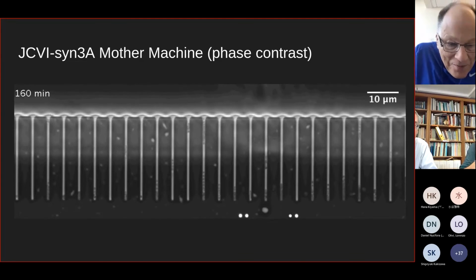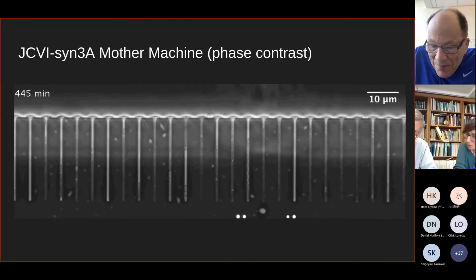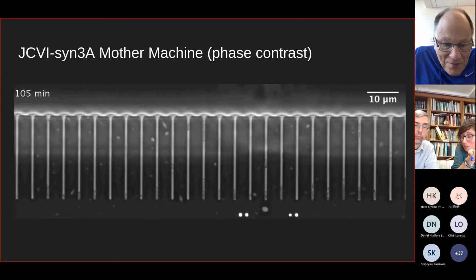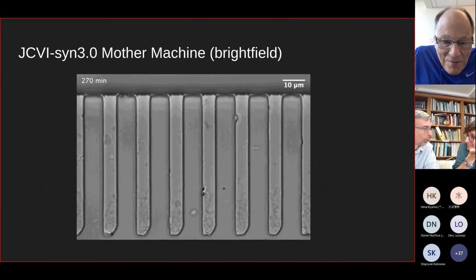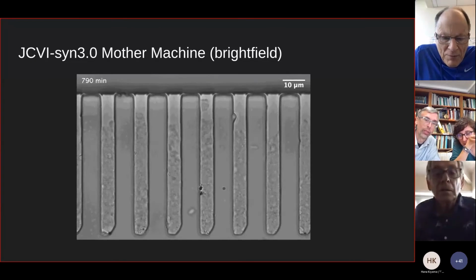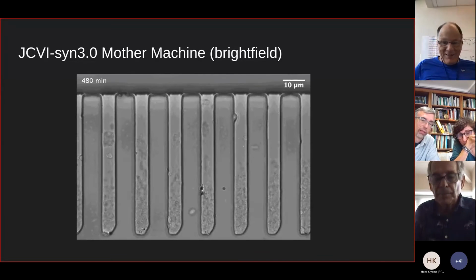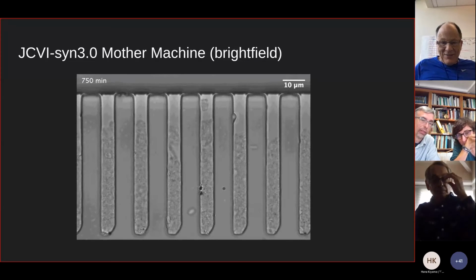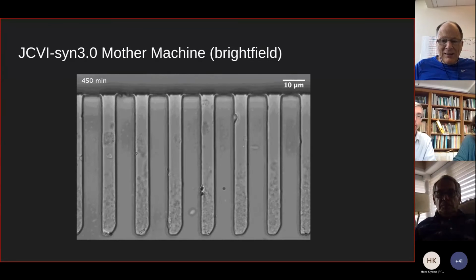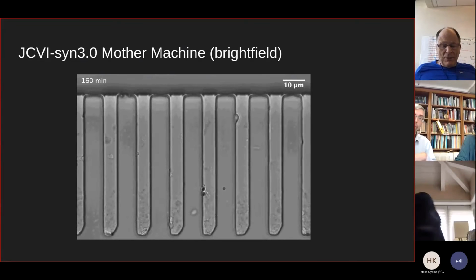I think one question that I have would be regarding the imaging conditions. So far you've looked at the cells in bright field. Have you tried any kind of fluorescence microscopy? No, I haven't had a chance to try fluorescence microscopy. But you have the strain with mCherry, don't you, Michael? Yeah, we do have I think Syn3B with mCherry, but I haven't had a chance to grow it yet. Okay, I think it's Syn3A that you have, but that's okay. And you should also have Syn1 if you need, but let me know.